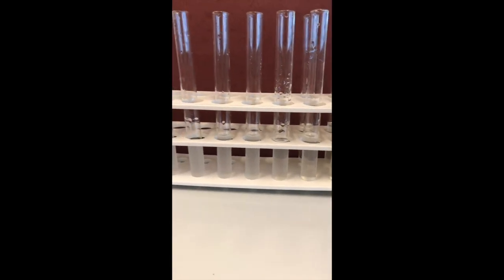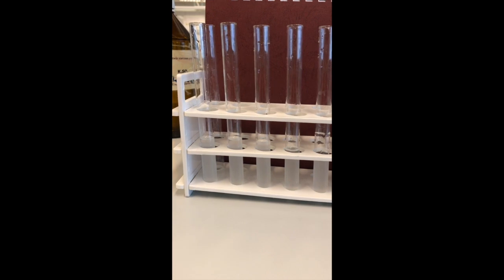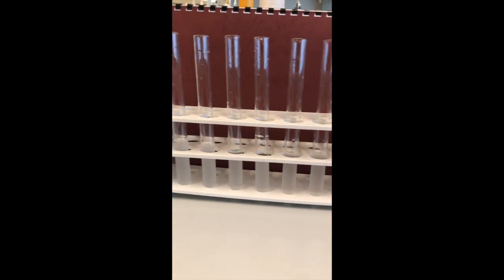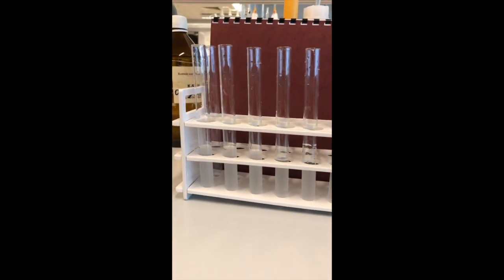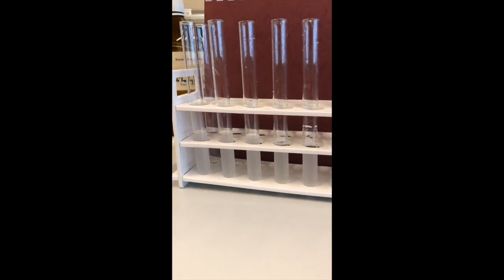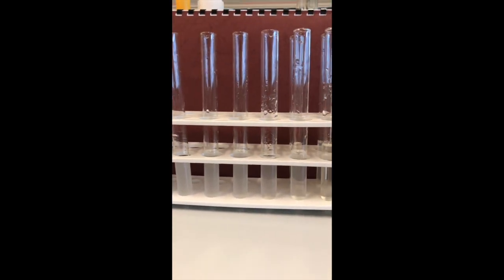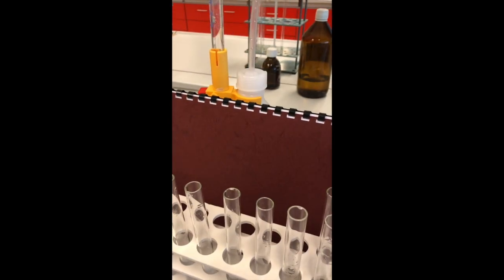Okay, so this is our scale of standards. I'm not sure if it's well seen, but as you see, it gets more milky with the higher concentration of sulfur dioxide. And in the back are our samples. This is the first sample.